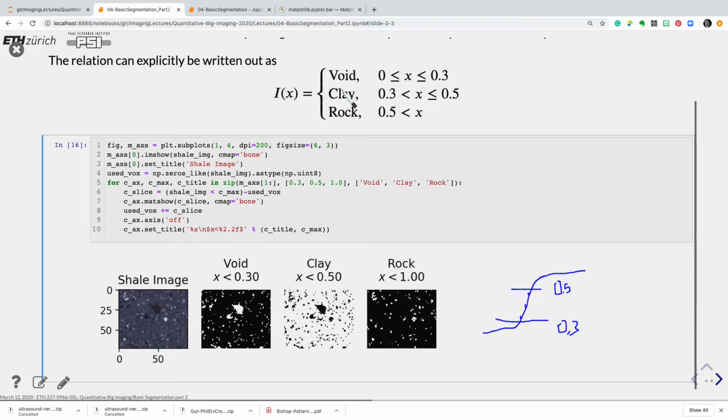And I have even seen papers where people are making interesting hypotheses about film coatings around stuff, which is essentially only an effect of misclassification. So please be careful when you start doing multi-class segmentation, not to interpret too much into films. And it gets even worse when people start using very creative color maps. Then you can get nightmares when you see it. It's really bad what can appear out there.